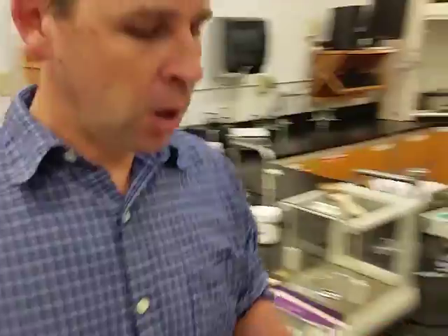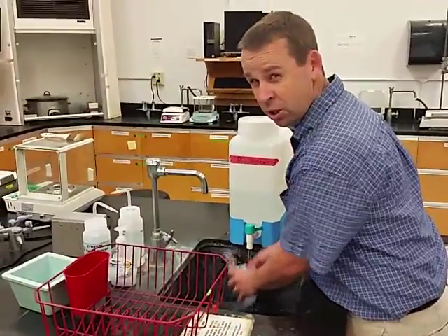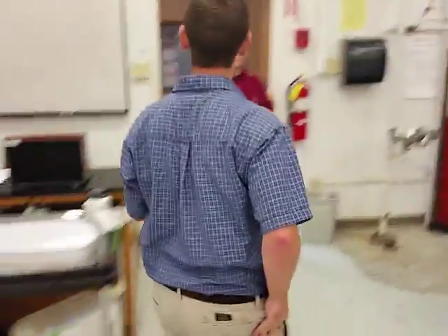All right. We also want to make sure that before we start, there's no residual salts in your cup. We also want to make sure that there's no residual water, right?